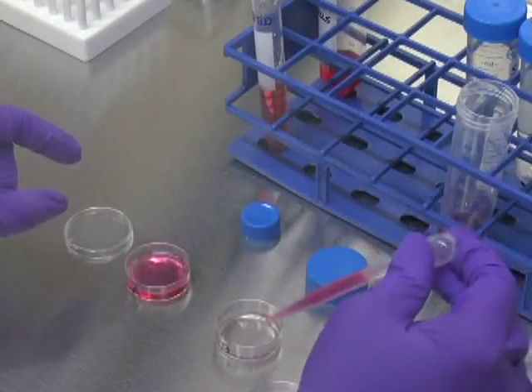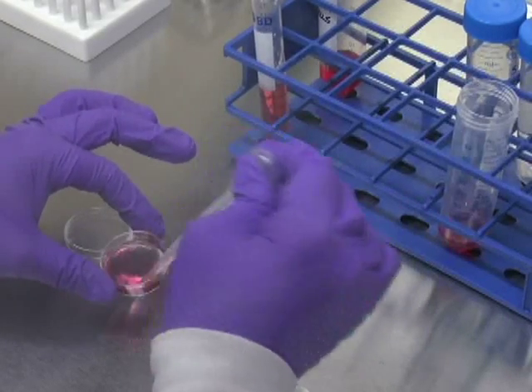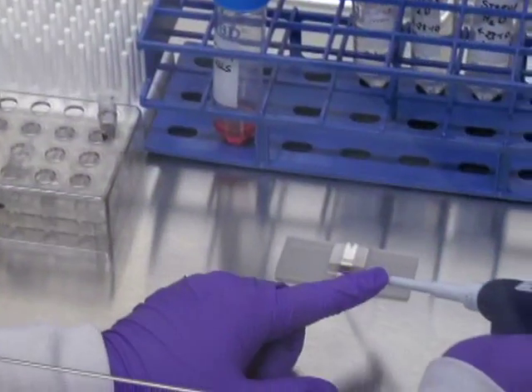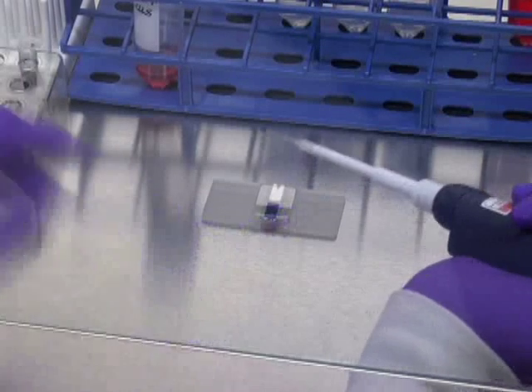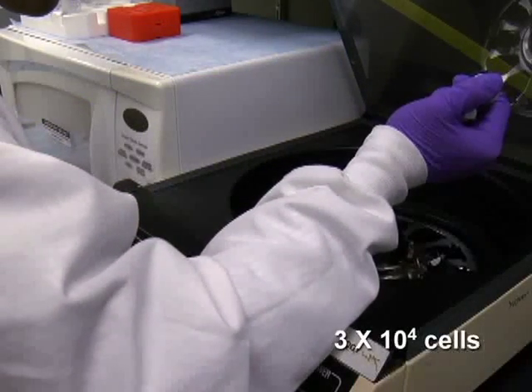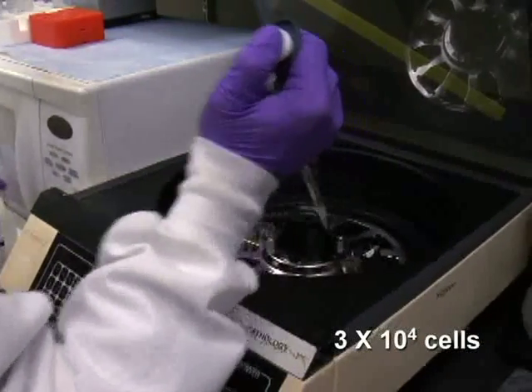For further analysis of differentiation and proliferation, cells from the entire CFC assay plate are recovered by suspending in several volumes of room-temperature 2% FBS IMDM, washed and counted. For morphological analyses, transfer 30,000 cells that were recovered from CFC assay plates to a slide using a cytospin centrifuge.